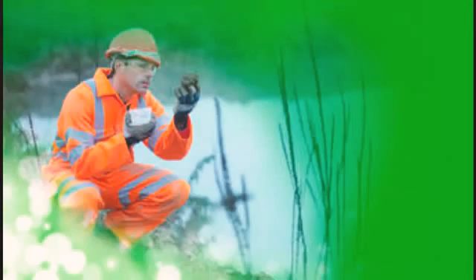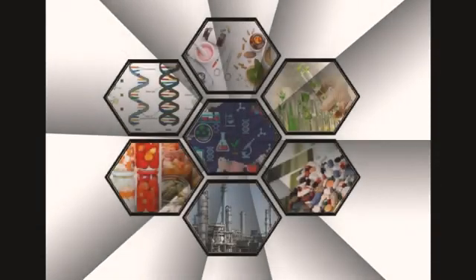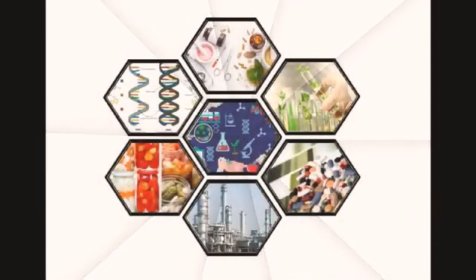The GCMS is used in a variety of different disciplines: chemical, astrochemistry, medicine, geochemical, industrial, security, law enforcement, food, beverage and perfume analysis, sports anti-doping analysis, pharmaceutical, biological, geological, environmental, and forensic research.